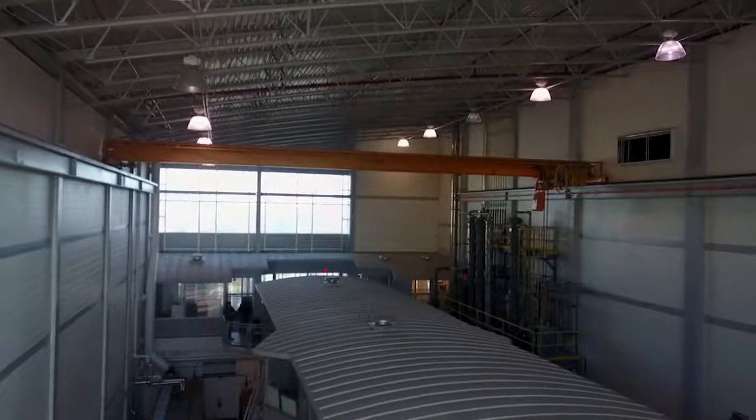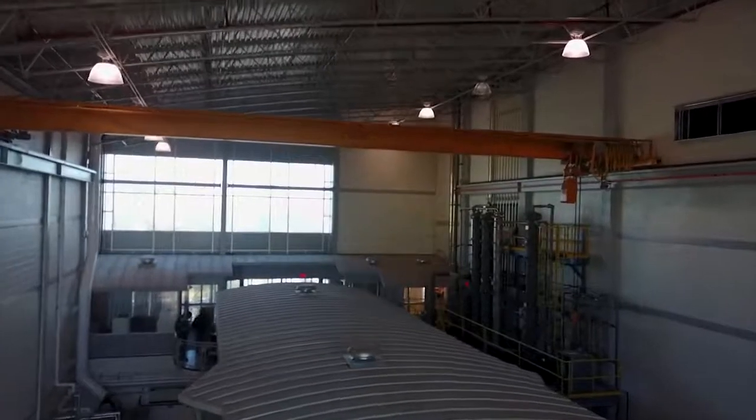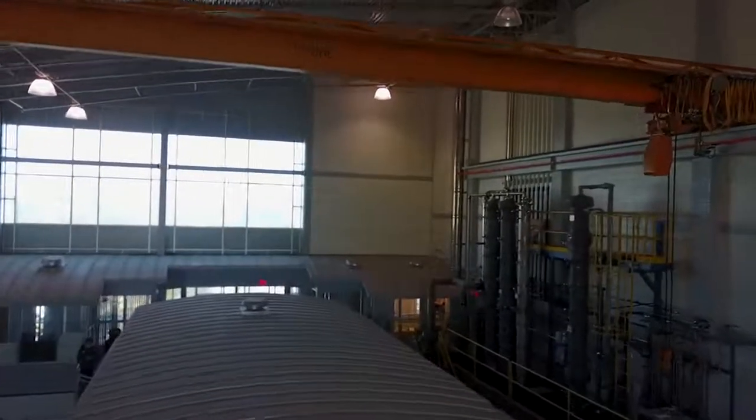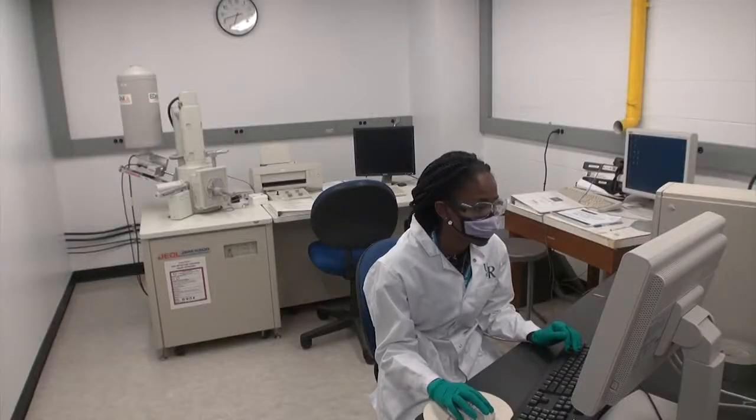The Greenhouse Gas Technology Center, or GGTC, offers approximately 12,000 square feet of laboratory and research space and 2,500 square feet of office and meeting spaces.